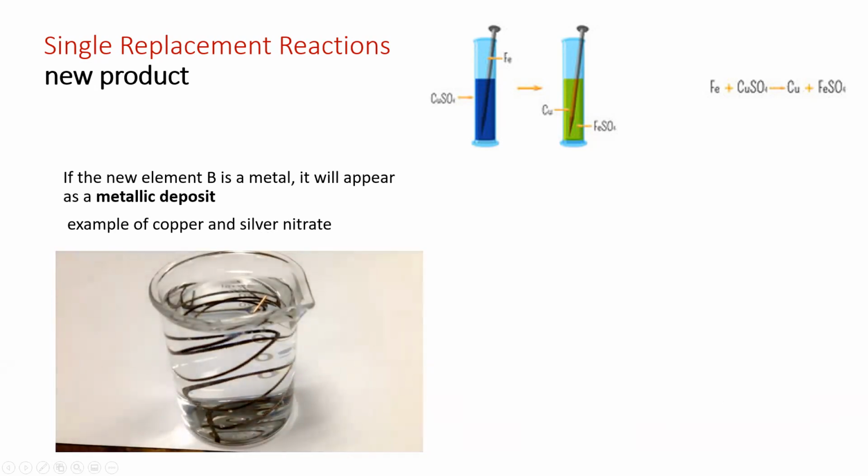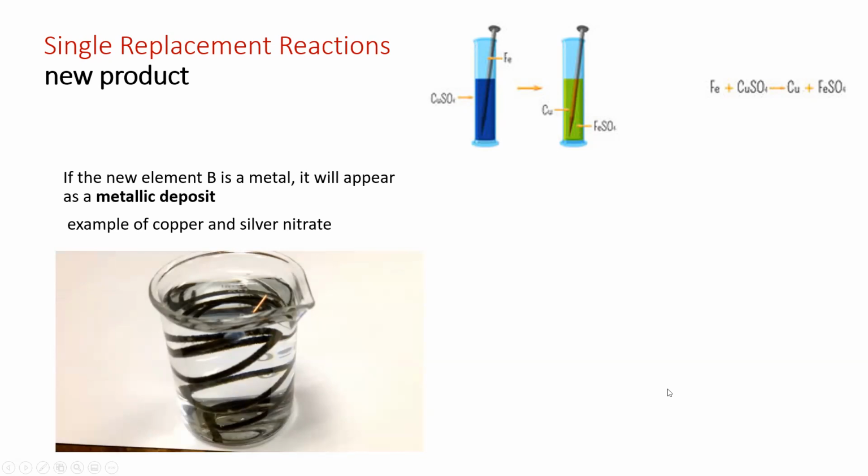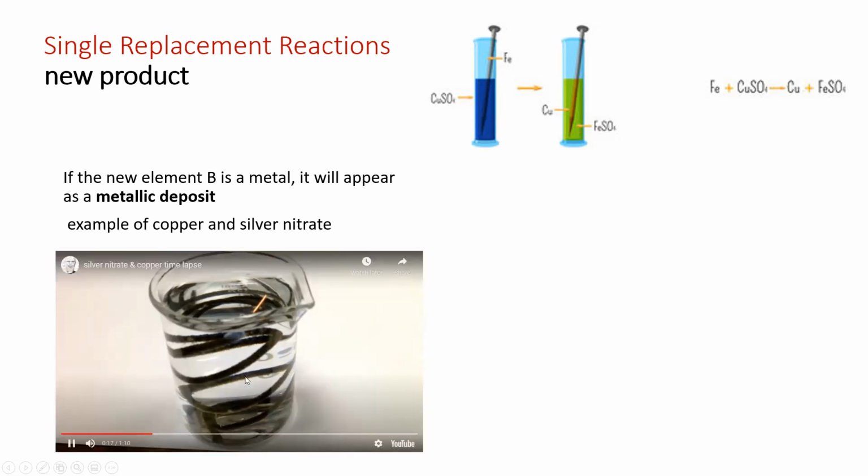Right away, you can see a little bit of change. And over time, this change becomes more prominent, and you get kind of a black fuzziness. That's one thing to remember. Even though some of these reactions take more time and it's not an immediate color change, when you see a little bit of change, that means there's a reaction going on. It's a change. That's a chemical reaction. So here this is developing kind of a fuzziness. That is a color change. It's not that brown wire anymore. It's a fuzziness that's black and now it's gray.